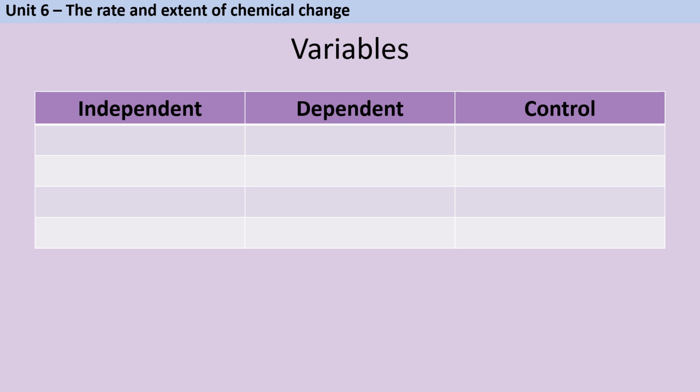For any investigation in GCSE chemistry, and to be honest, any science at all, it's really important before you start to identify your variables so that you're only changing one thing. According to the required practical, you need to change the concentration, but it doesn't actually specify the concentration of what. In the video I'm going to show you of me doing the practical, I changed the concentration of the sodium thiosulfate, and this is purely because it's a much larger volume, and therefore for my year 9 pupils it's easier for them to handle changing the concentration of that. But actually a lot of protocols for this practical talk about changing the concentration of the acid instead. Whichever one you do, it's totally fine, but it's important that you're only changing the concentration of one of them.